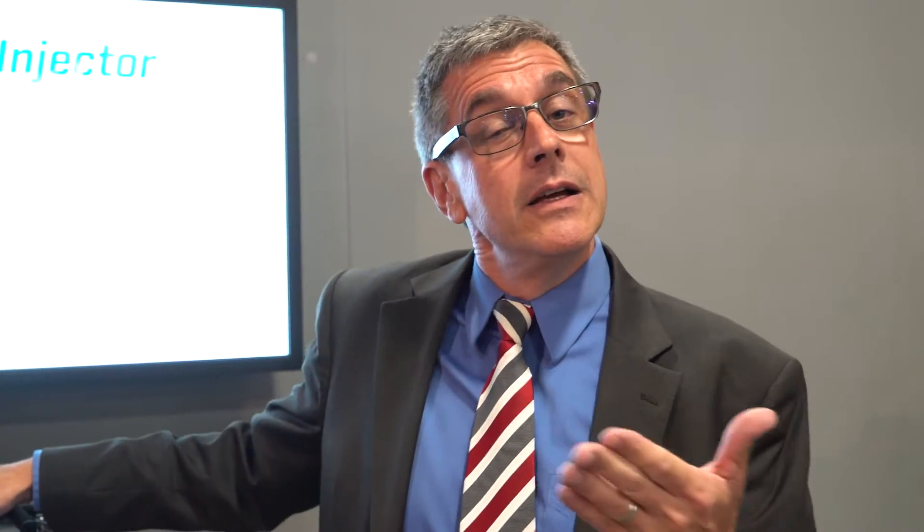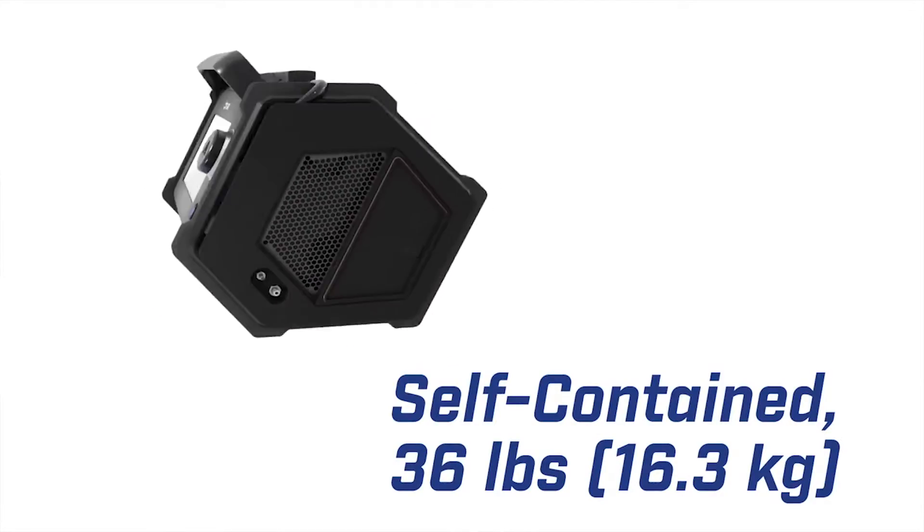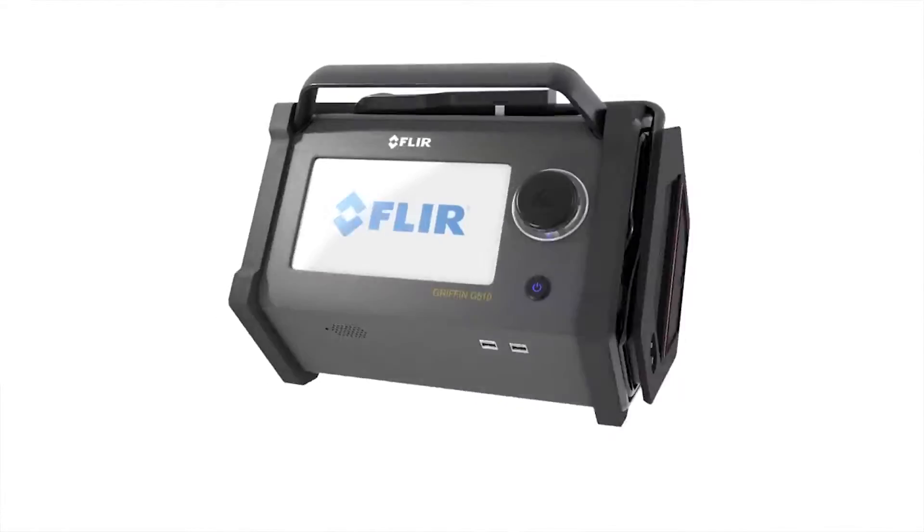As part of the program, we're going to be developing a sample interface kit that makes the system really simple to use. It's actually kind of amazing — you typically would find a GC mass spectrometer in a laboratory being operated by highly trained scientists in white coats, and we've developed a box here that's 36 pounds. It can be carried downrange. We can take the technology to the sample instead of bringing the sample to the technology. Our goal is to have this used by any soldier out there, with a sample interface kit that's simple enough to utilize this really sophisticated piece of equipment to identify nasty chemicals.